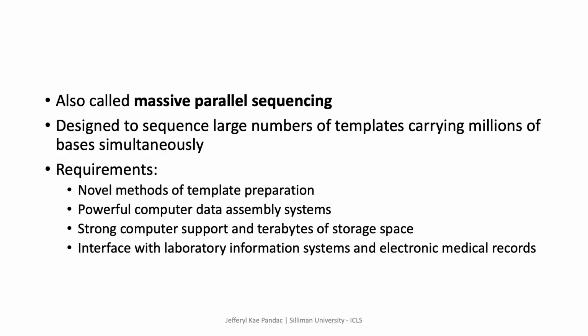Next-generation sequencing, or NGS, also called massive parallel sequencing, was designed to sequence large numbers of templates carrying millions of bases simultaneously in a run that takes a few hours. NGS technology has achieved gigabytes of sequencing data for a minimal cost, making genomic studies a routine component of both research and clinical analysis. NGS requires novel methods of template preparation, powerful computer data assembly systems to organize the massive amounts of sequence information that are generated, strong computer support, as well as terabytes of storage space to accommodate large raw data sets, and an interface with laboratory information systems and electronic medical records.